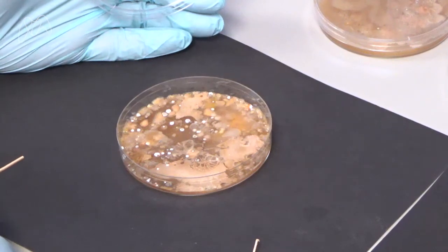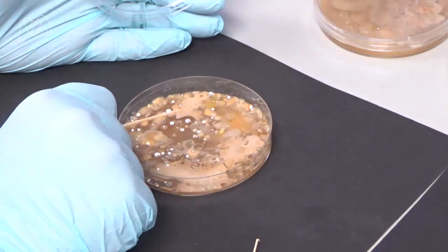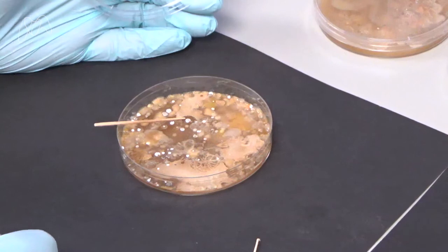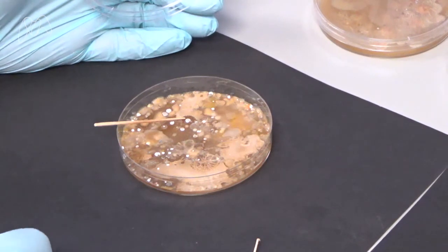When I talk about colonies, we're talking about a single bacteria that's multiplied over and over again. This is a good example. A single bacteria is so small that it cannot be seen with the naked eye, but once it's multiplied over and over, we can start to see the way that it grows.